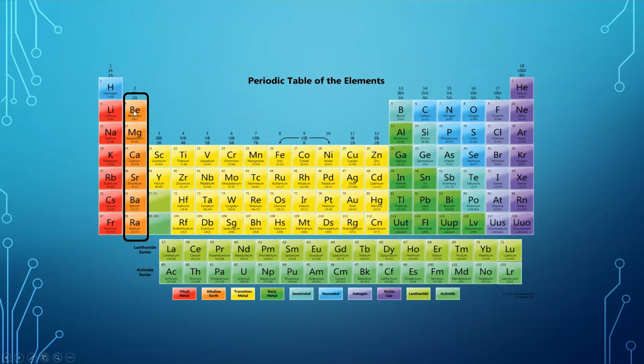And we're going to study the elements in group 2, specifically magnesium, calcium, strontium, and barium, and see what trends we can observe. And the important thing to keep in mind is a trend allows you to make predictions. So I don't want you to just tell me what you observed in each of the reactions today. I want you to tell me what it means.